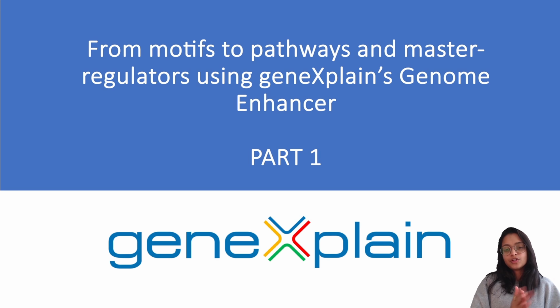In some of the previous videos, I have spoken about what motifs and transcription factor binding sites are. I've also walked through a couple of demonstrations in finding motifs and enriched transcription factor binding sites in epigenomic datasets. And continuing that theme of discussion, we are taking it a little bit ahead in this video, and we will be performing an integrated promoter and pathway analysis and identifying master regulators using multi-omics data.